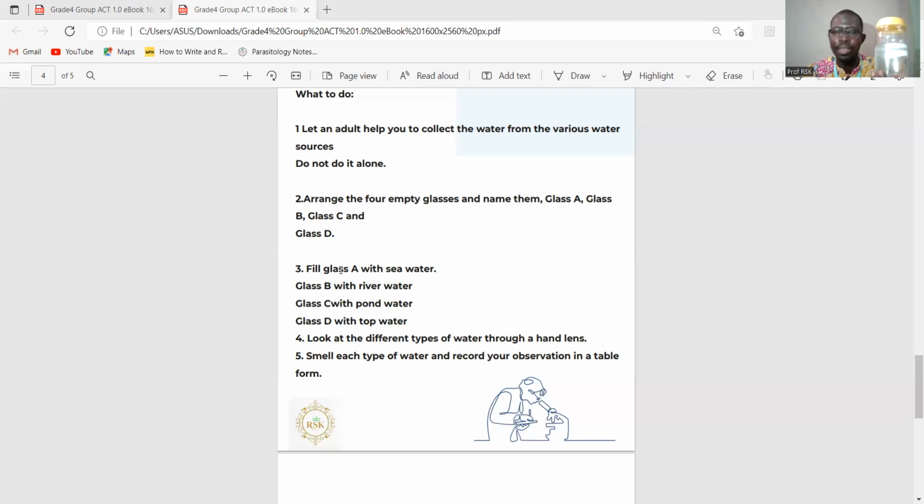It is odorless. And so by far, with these 4 water samples that I have displayed today, I can say the best of them all is the tap water, all right? So if you want to drink any water at home, please make sure it is the tap water and not the well water, nor the sea water or the river water, all right?